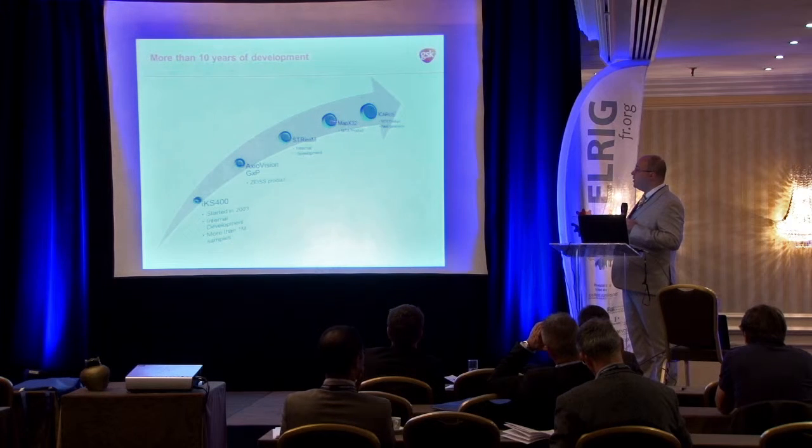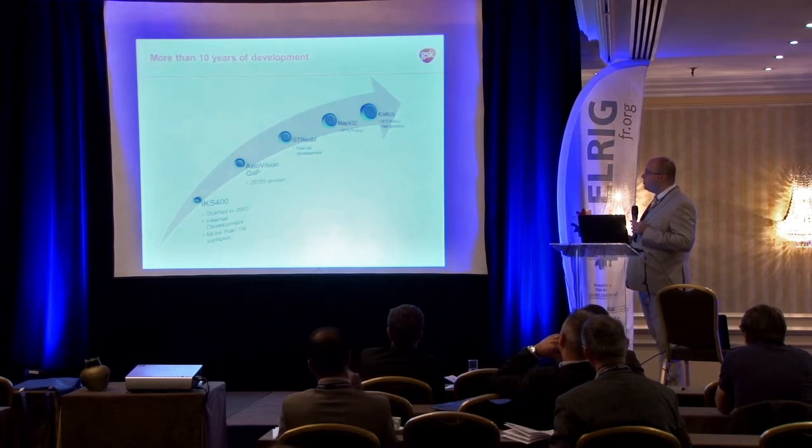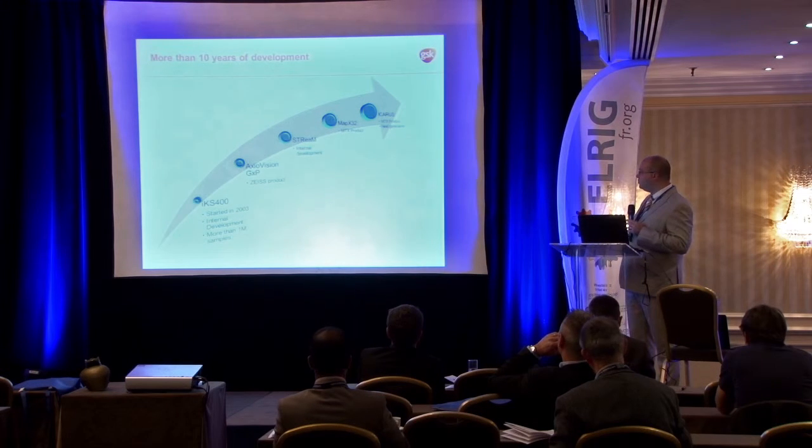That's why finally we came back to the commercial product, which is now developed by Microtechnics, and the next generation will be the Icarus, the one you have seen on the booth of Microtechnics, which can be used also for image analysis systems.